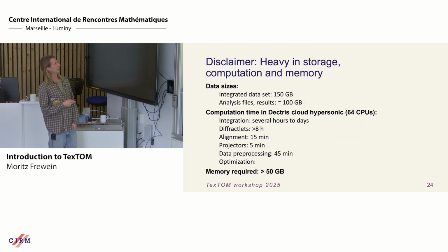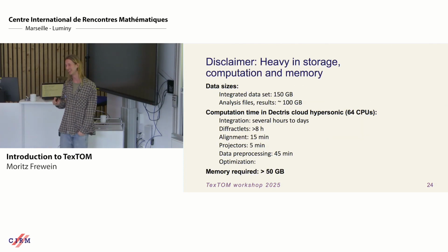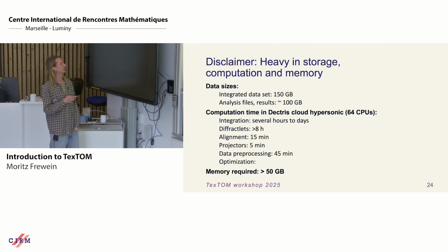Another disclaimer, as Tilman already mentioned, is that we have a lot of data, and it's also quite heavy on the computation side. So make sure you have enough space. This data set that we'll be working on has like 150 gigabytes. You also need some storage for the intermediate results, and you need to take some time.